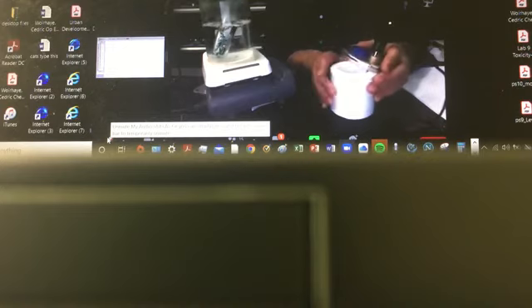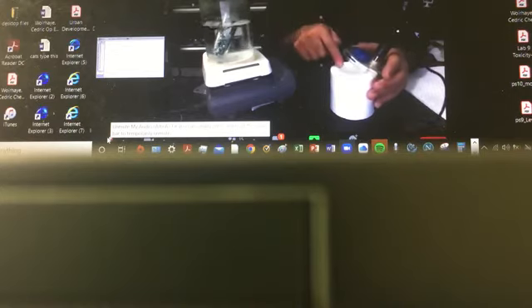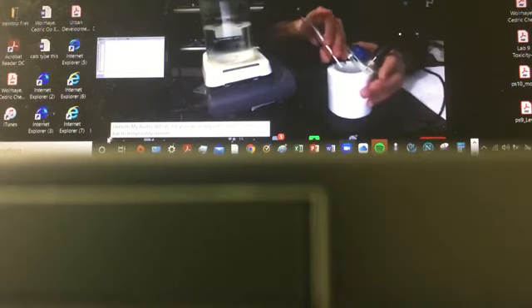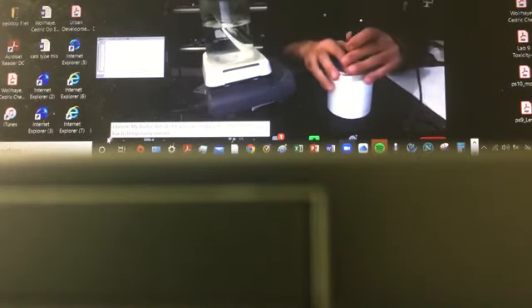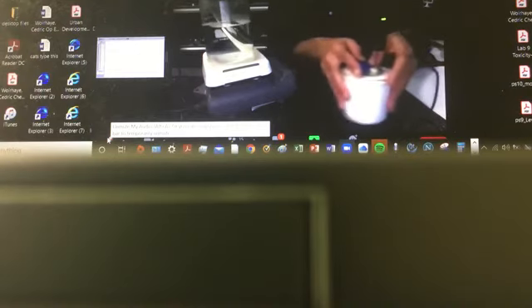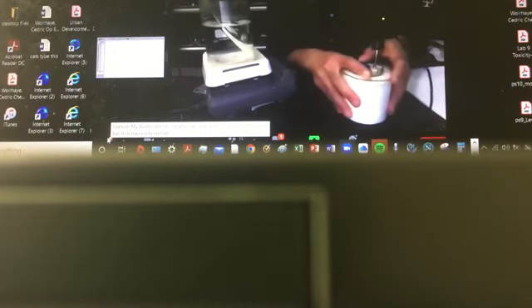Okay, so it's still measuring the temperature in the water. So I open the calorimeter. Okay, the thermometer still measures the temperature of the water. So use the metal, just give them enough shaking so all the metal is now surrounded with water.